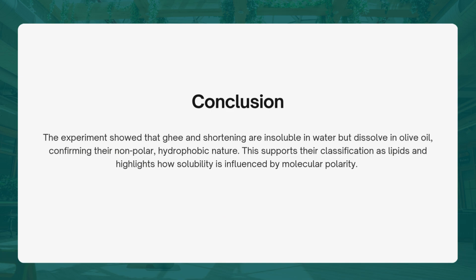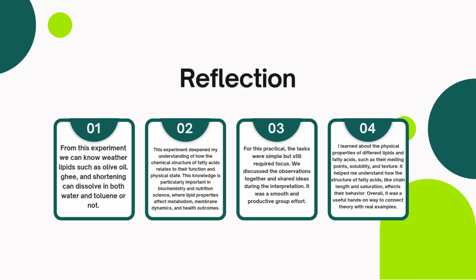To conclude, the experiment showed that ghee and shortening are insoluble in water but dissolve in olive oil, confirming their non-polar hydrophobic nature. This supports their classification as lipids and highlights how solubility is influenced by molecular polarity.